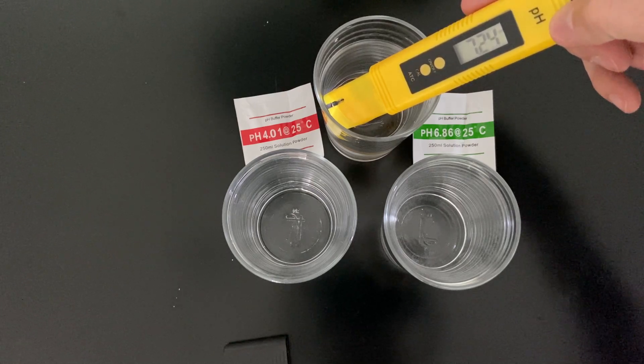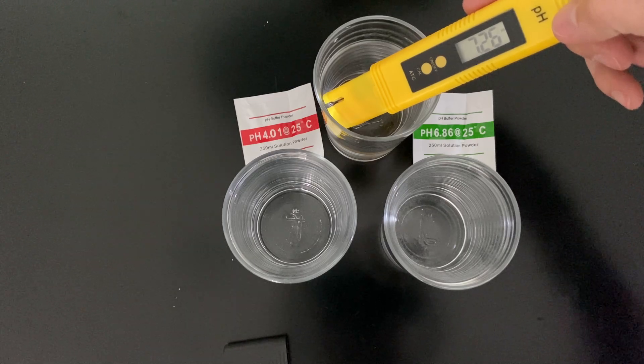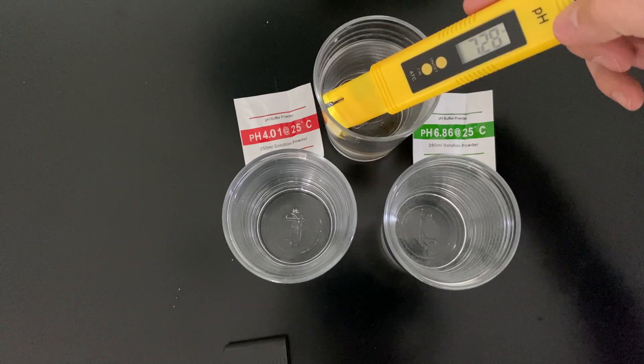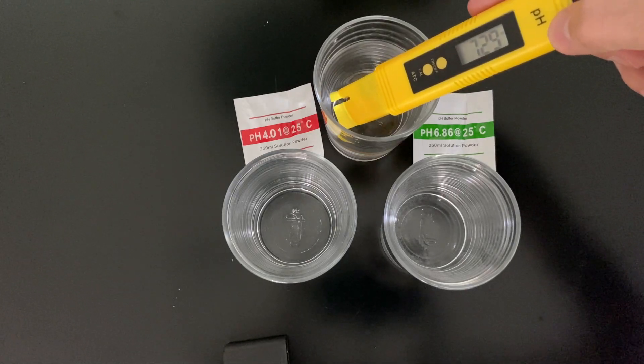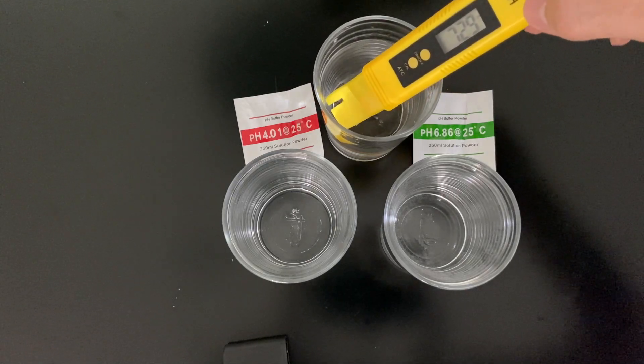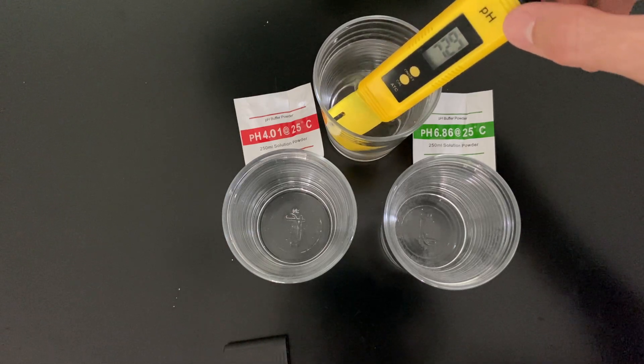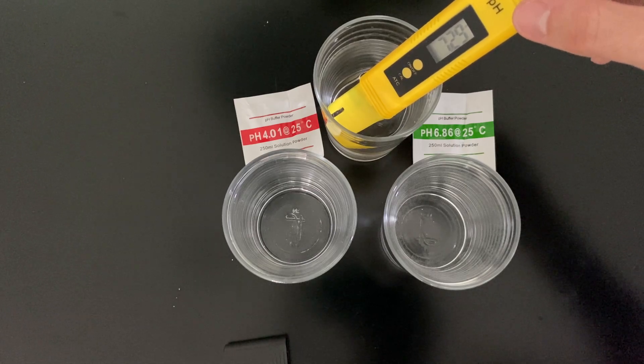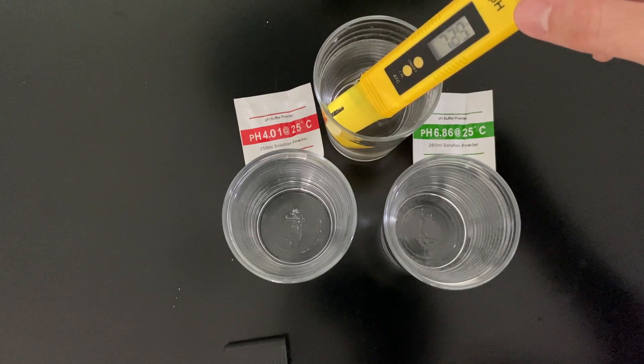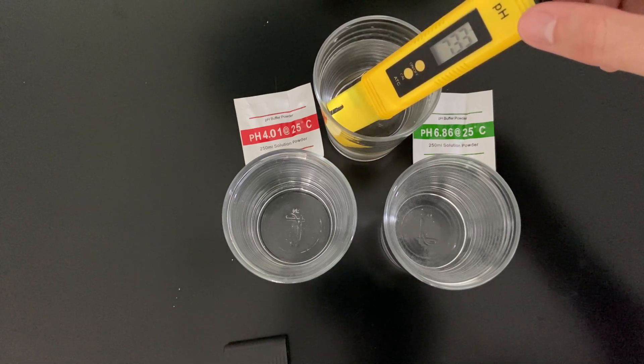It's showing 7.37, 7.28. So this is my normal water supply here, the tap water. You can see it's around 7.3 pH.